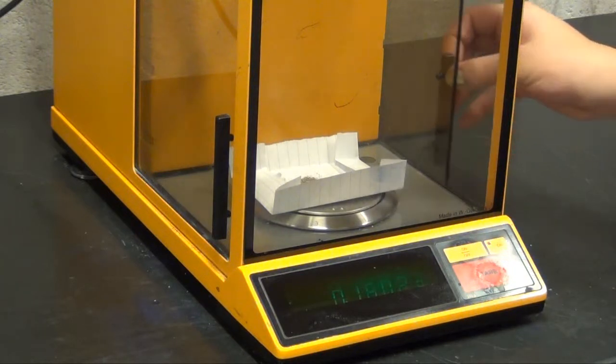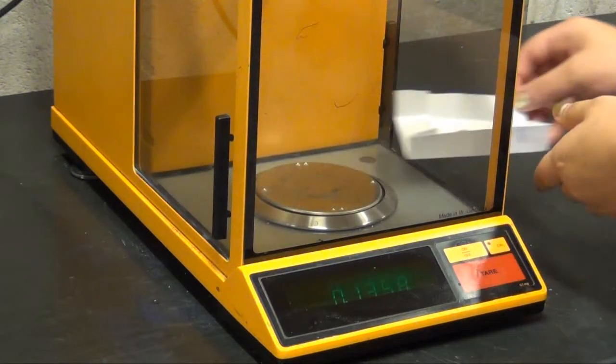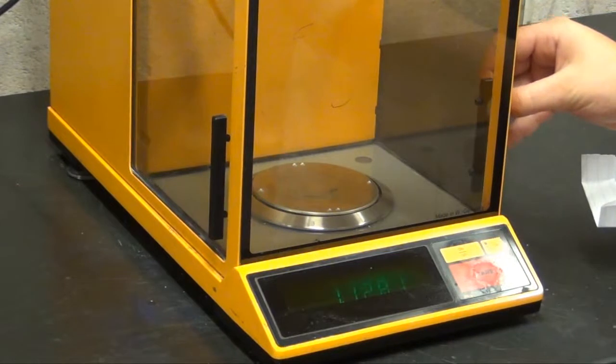We require one gram, so we need to place quite a lot more of the sample into the boat.